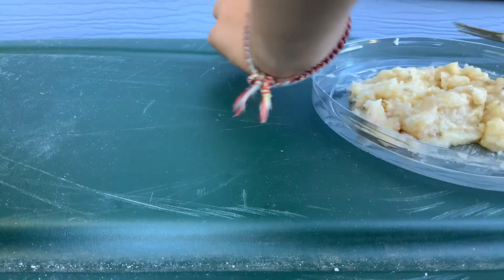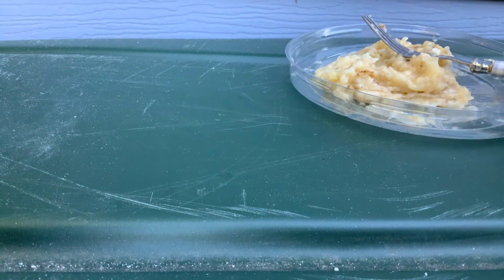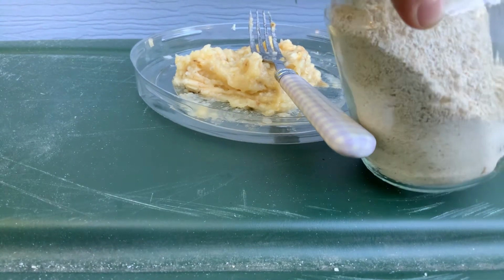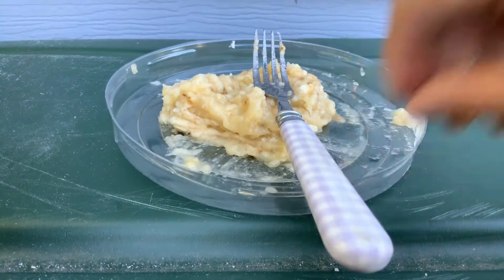And then, mush a little bit more. There. Banana mush. Yay. That's really the base for our fly media. So here I actually use ground up oats, which I ground up myself with a rock and a bag. And you can use those instead of like instant potatoes or wheat bran or whatever. I just didn't have anything like that right now.